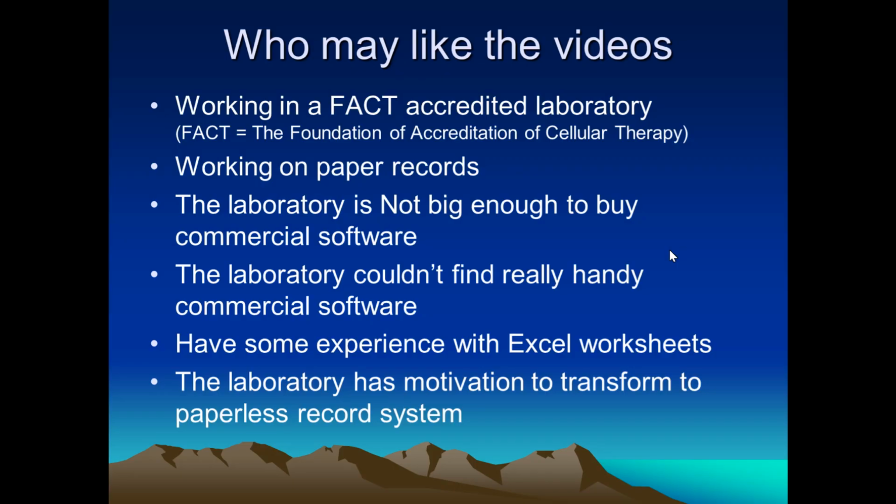If you have some experience with Excel worksheets, and also the lab leadership has the intention to transform to a paperless record system, this may be the video you will benefit from.